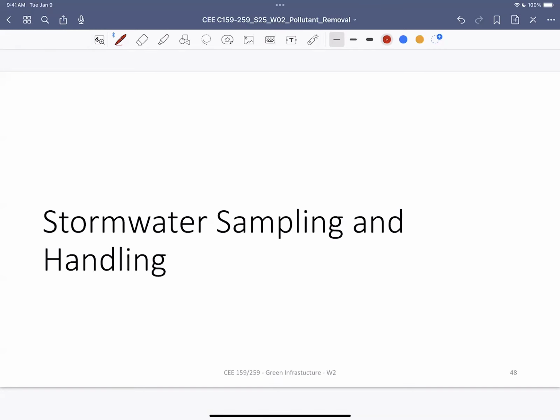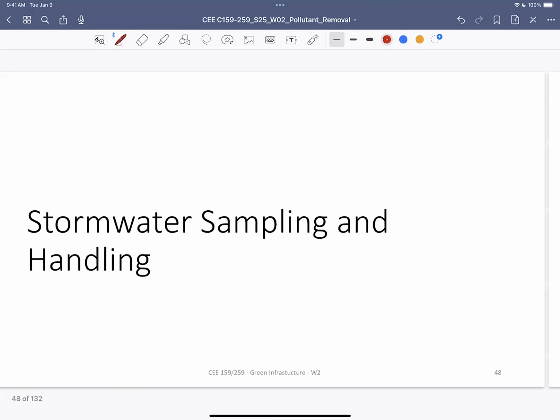In this video, you're going to learn how to sample stormwaters, how to handle them, including how to store them, and how to process the samples so that you minimize the error in concentrations.